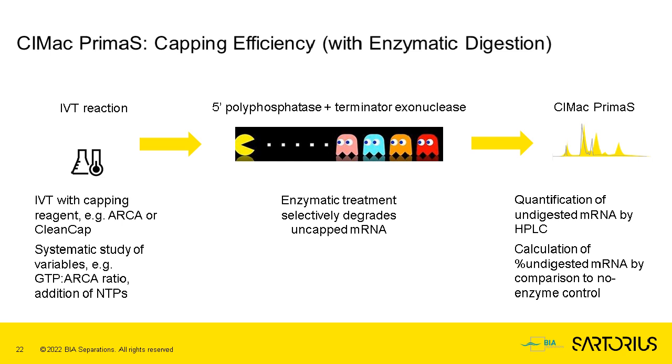One of the key quality attributes is also capping efficiency, and there are very sophisticated mass spec-based techniques to determine capping efficiency of IVT reactions.